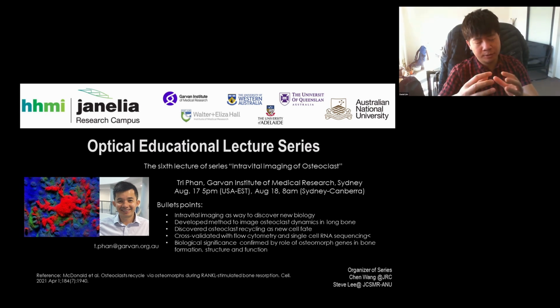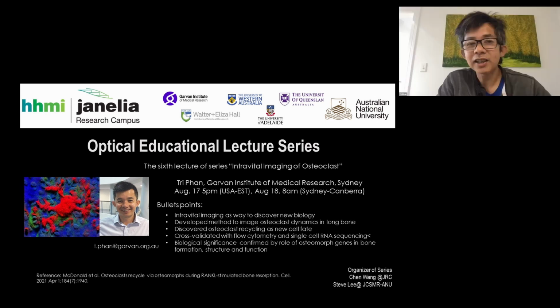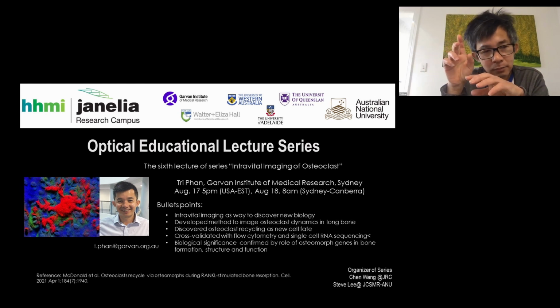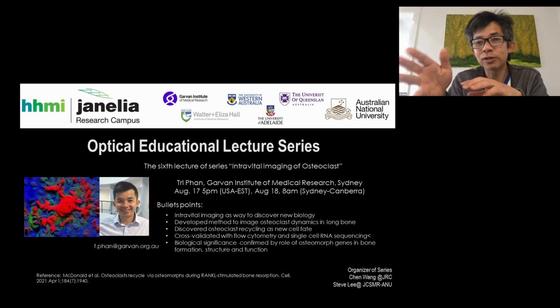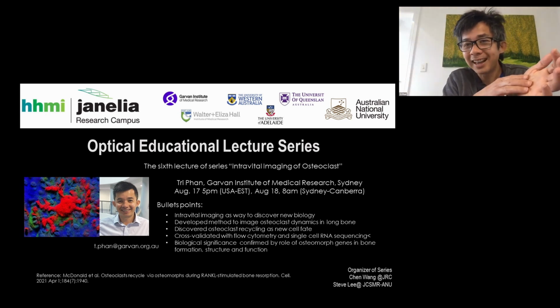Right. And I'm guessing these fission events, do you think the sites where the fission occurs relate to the porosity of the bone, where the fission occurs at regions of lower porosity, where the spacing is much lower? Yeah, that's a really interesting question. So we want to get to a lot of these things, and a lot of the key to that is going to be working out how to measure or mark those indicators that you're alluding to that might be driving the fission.